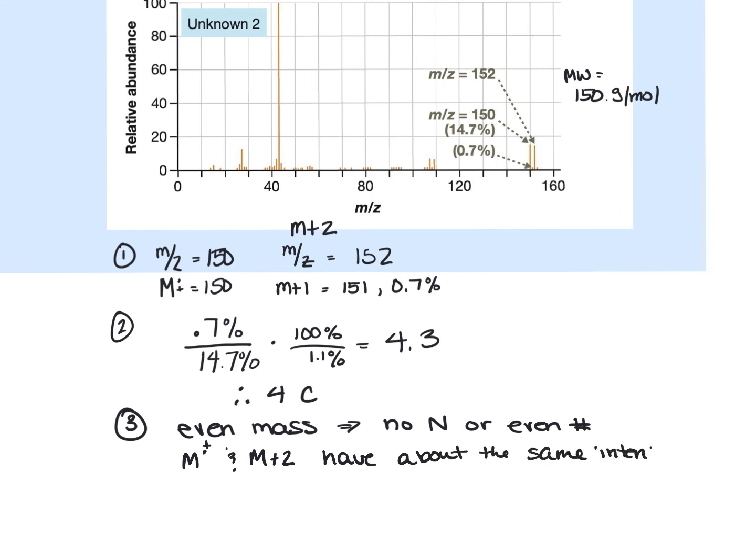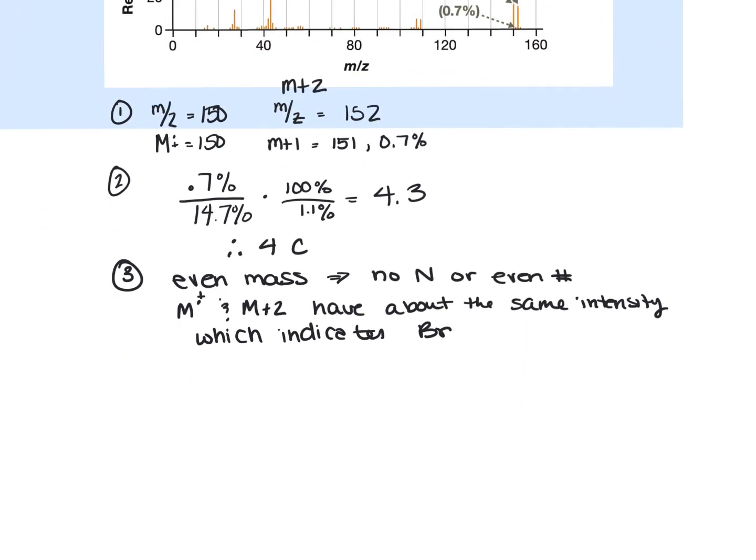And so that indicates a bromine atom. Okay, so we're pretty sure this sucker's got a bromine in it.